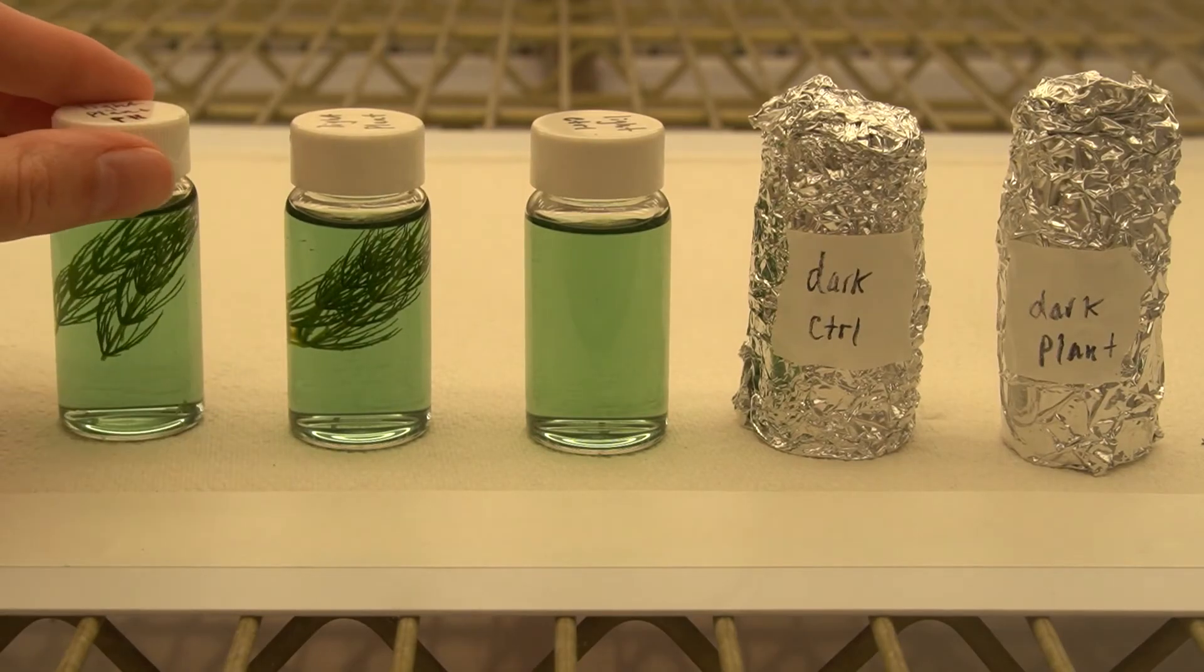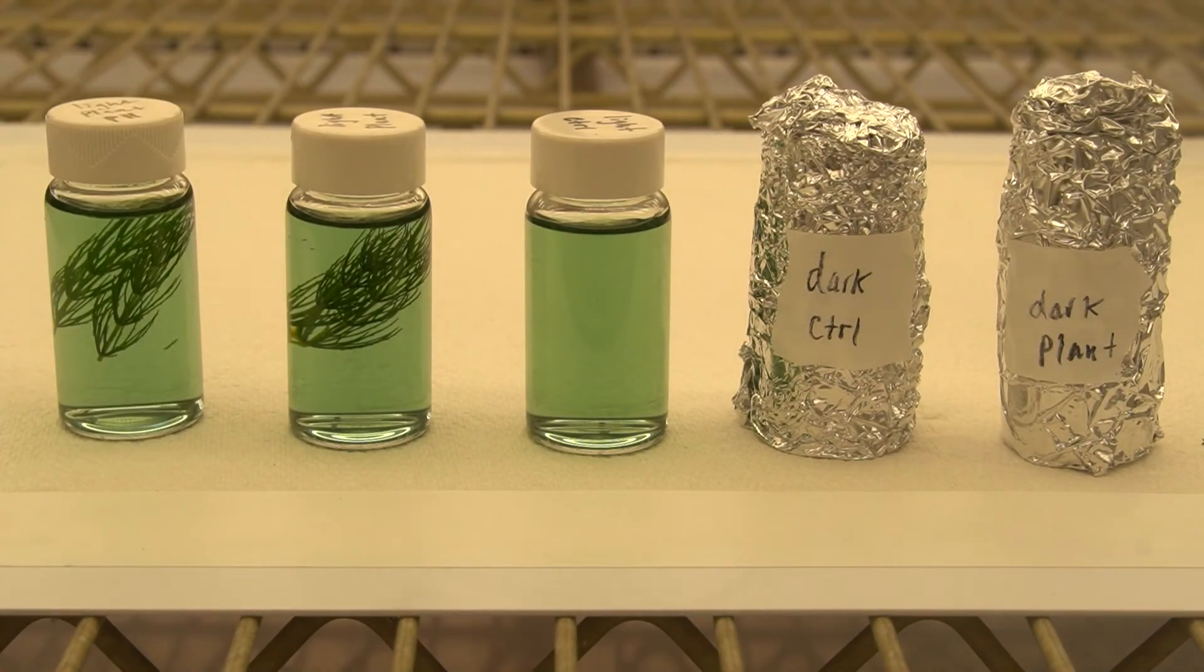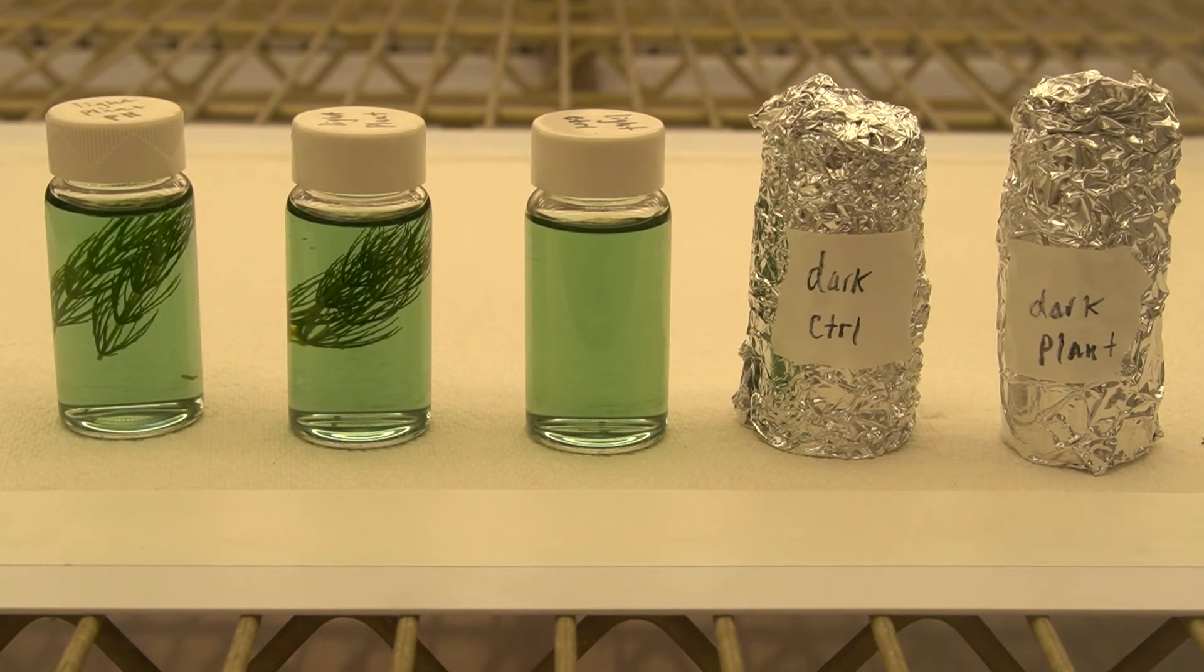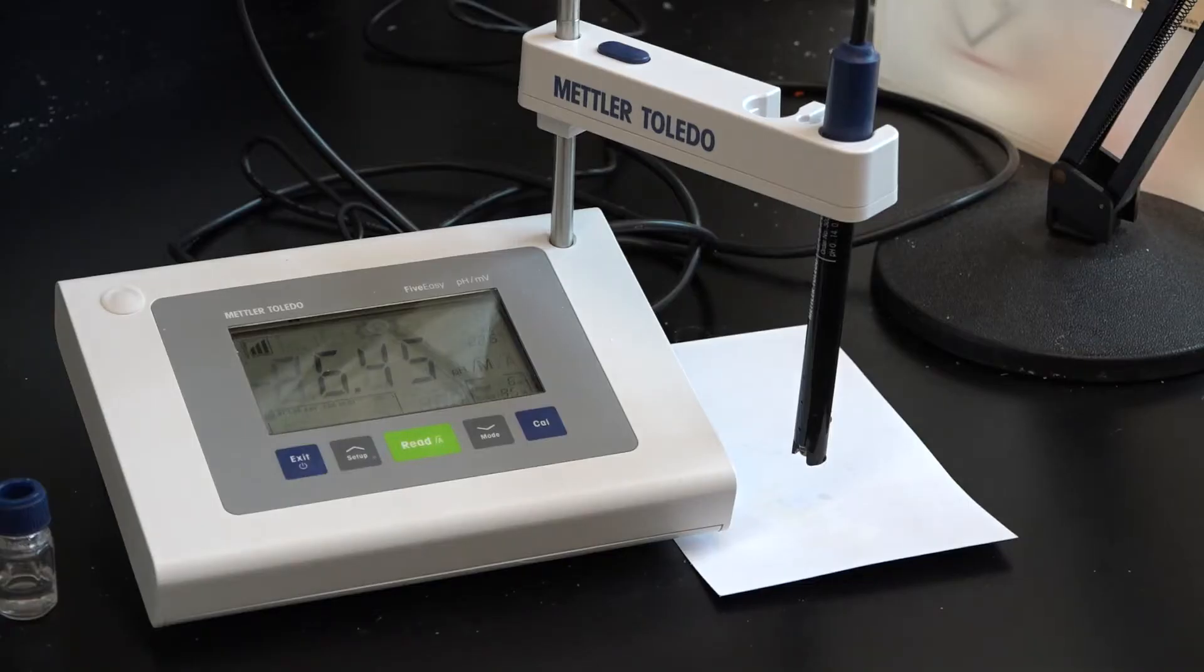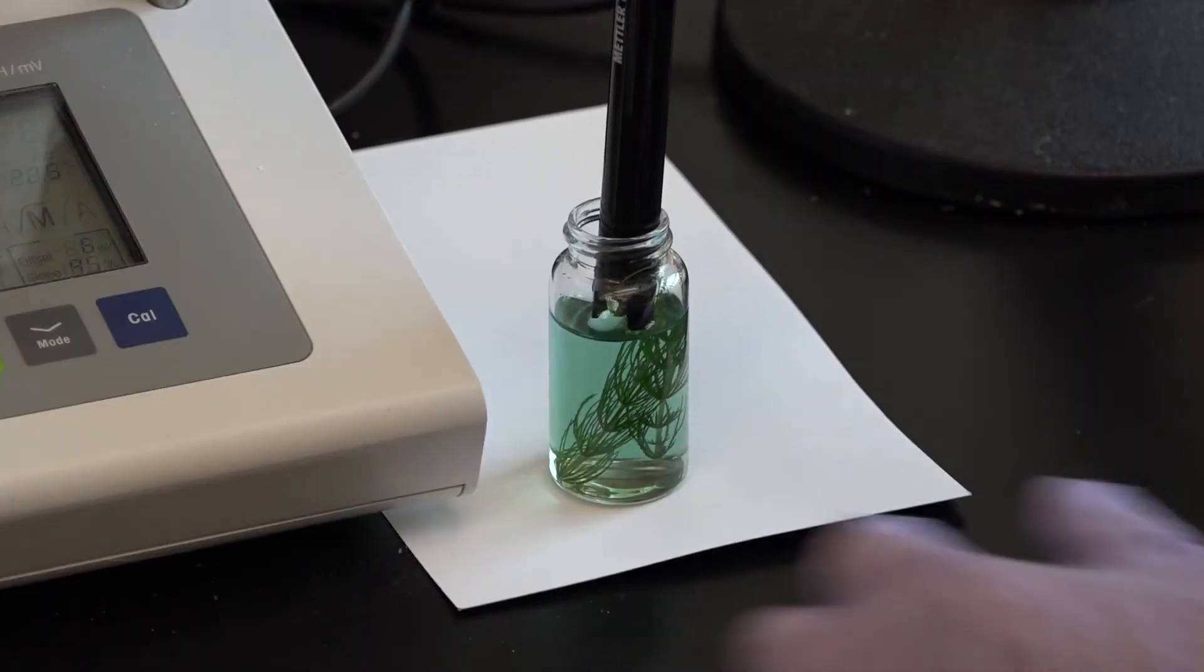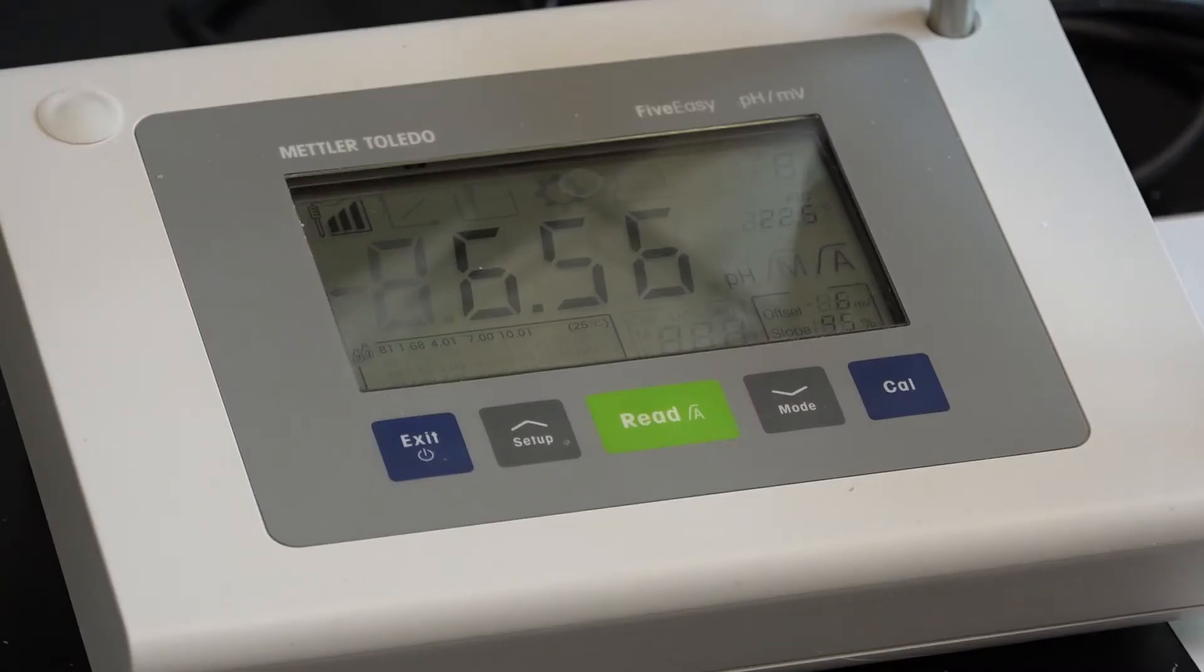Here's an additional plant vial that will stay in the light. I'm going to use a pH meter to precisely quantify its pH throughout the experiment. Let's take an initial reading to see where we're starting off. This is the pH meter. I'm going to place the sensor inside the vial, press take reading, and voila! It's 6.63.